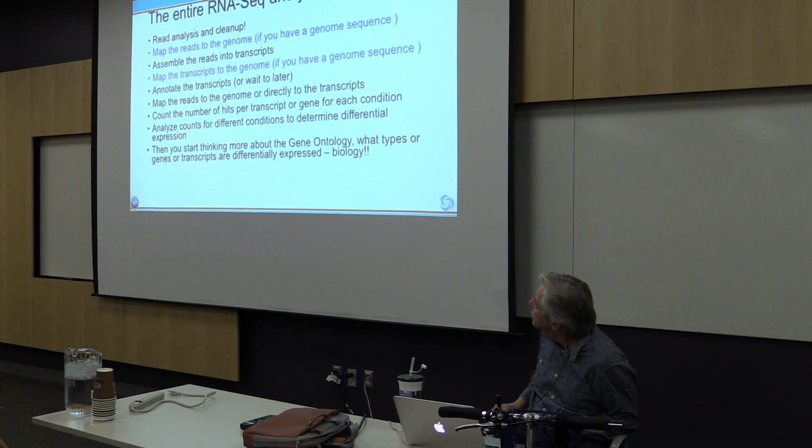First, we analyze the quality of the reads and we clean them up.